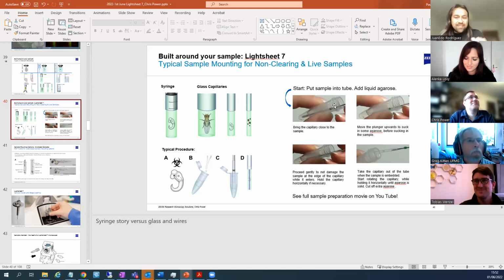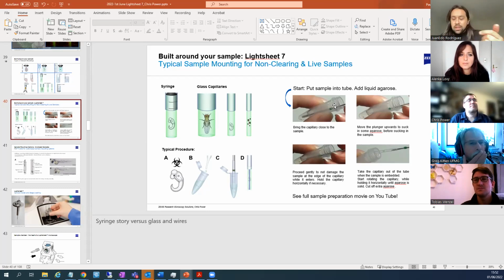Yes. Yeah, nice. And thanks for the talk. Nice images. And I have two questions. First, how easy is it to change your acquisition objective? Do you need to remove the sample, to remove the buffer from the sample chamber? And second, you have a two-side illumination light sheet, right, with one acquisition arm.